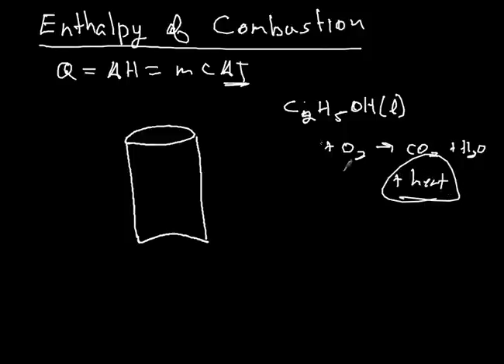Okay, and so what you'll do here is you'll put some water inside of the can, some quantity of water. You'd measure it out, and you will put your source of ethanol underneath it, and you'll light the ethanol, and it's going to burn.